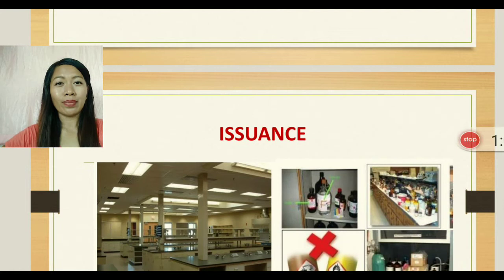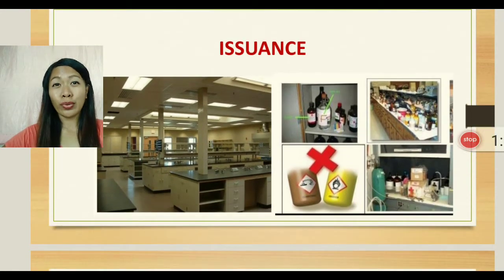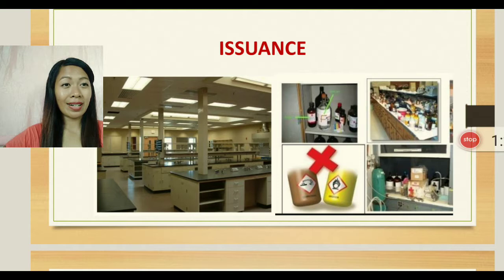Alright, so let's go directly to issuance of materials in the lab. You can see the laboratory in the picture, and the lab is where the students perform their experiments or activities, and they need some chemicals, equipment, and apparatus in order to perform their laboratory experiments.